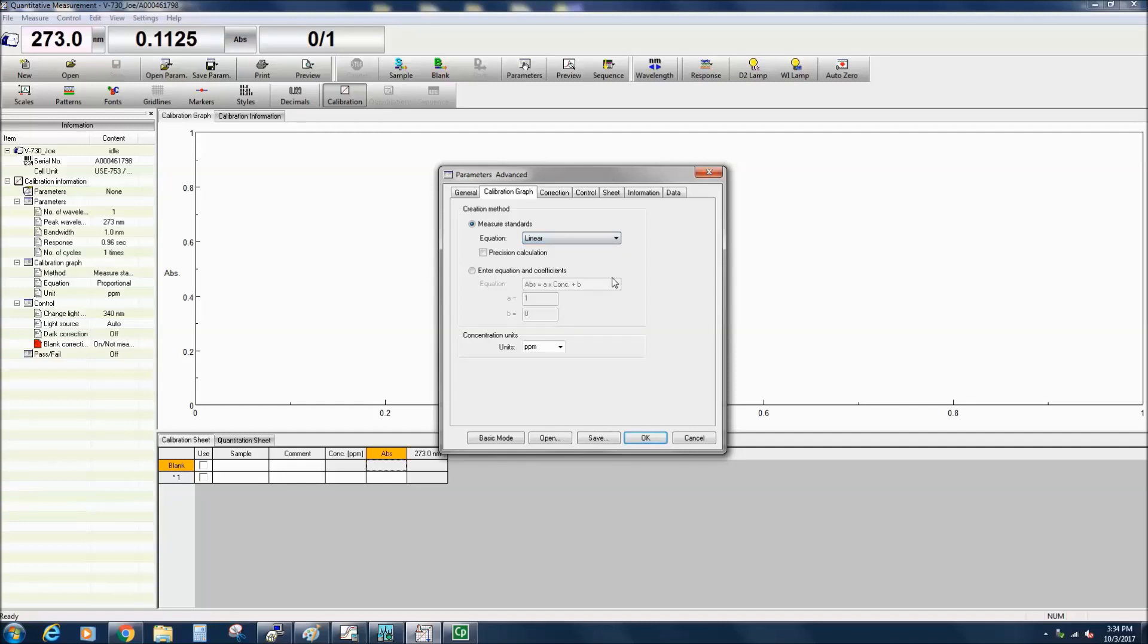In Basic mode, only Proportional and Linear methods can be selected. If the calibration curve is created using either the linear, quadratic, or cubic methods, the precision calculation box can be checked, which will display a 95% confidence interval on the calibration curve graph and provide the detection and quantitation limits which are displayed in the calibration information tab.